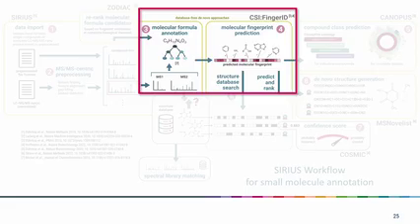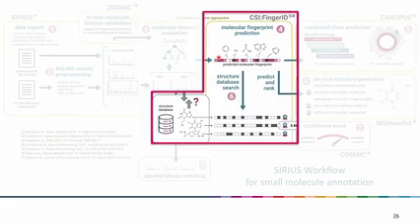So we now have our input, we need to predict a molecular fingerprint. What we are interested in now is comparing it against fingerprints from structures. Where do they come from?